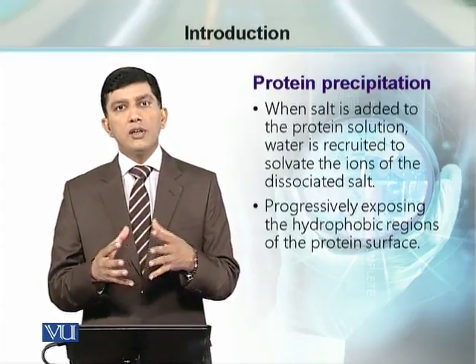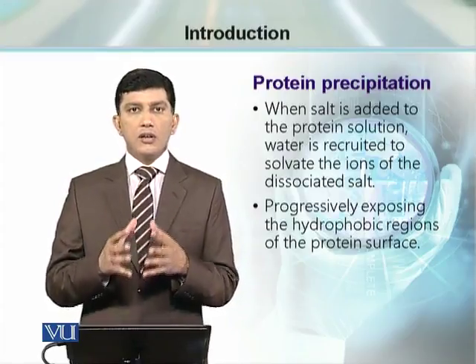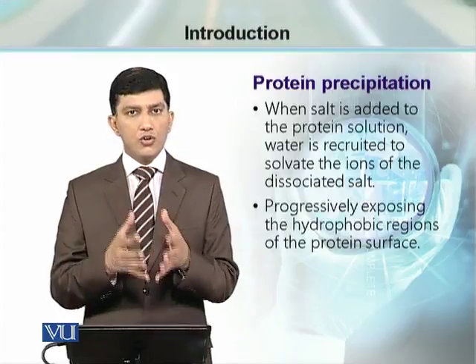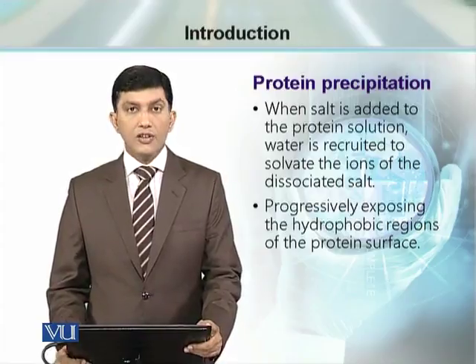When those sites interact with each other, then protein starts precipitating, and after a reasonable time the protein can be seen sitting down or precipitated in the tube or in the beaker as a white mass which can be separated by centrifugation.